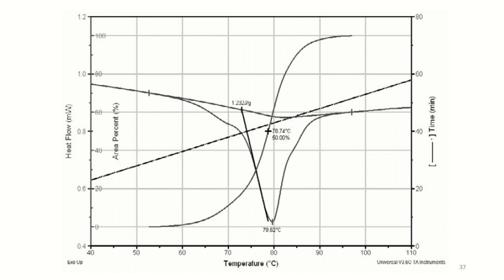There is great flexibility in analyzing the data. For example, in this picture, the 10% concentration data is shown with a sigmoidal baseline, and the percent denaturation is plotted as a function of temperature.